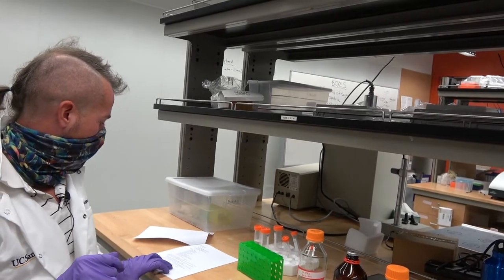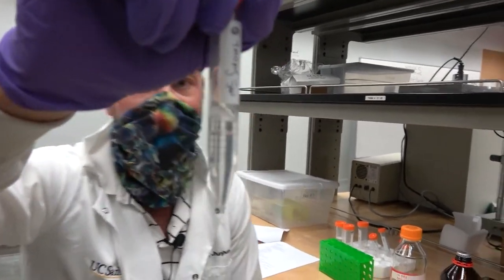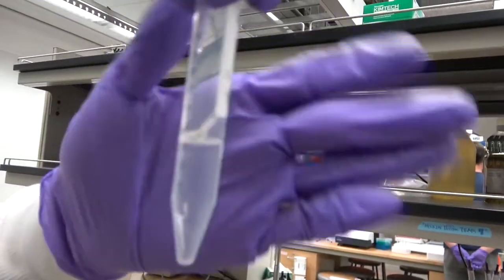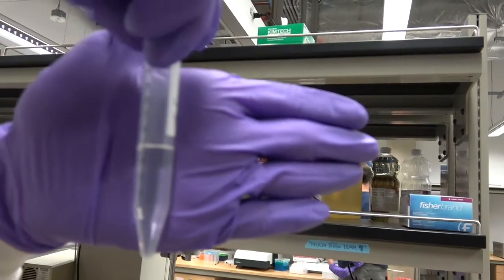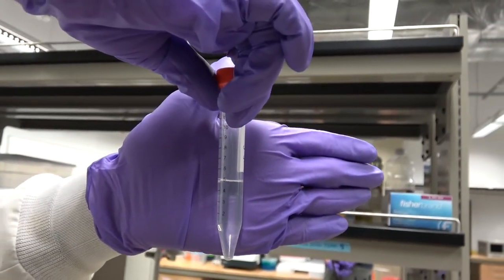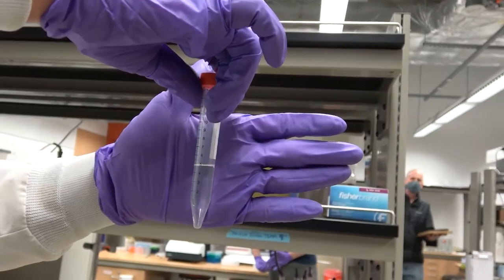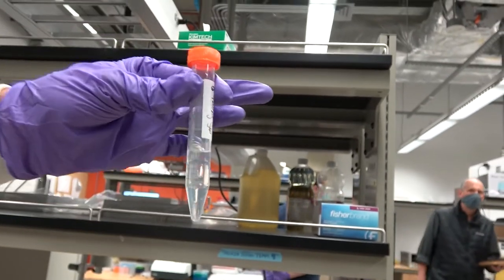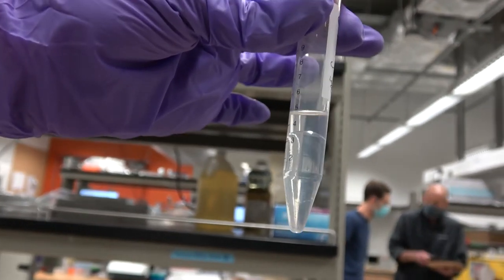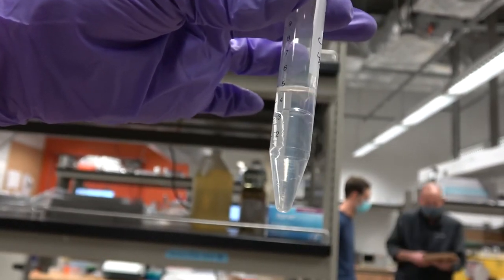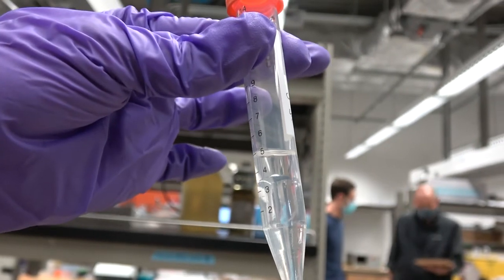Step 1b: note the miscibility. Let's see if we can get this, let me get my face out of the way. Hopefully you can appreciate that there is one layer floating on top of the other. See the little meniscus there?